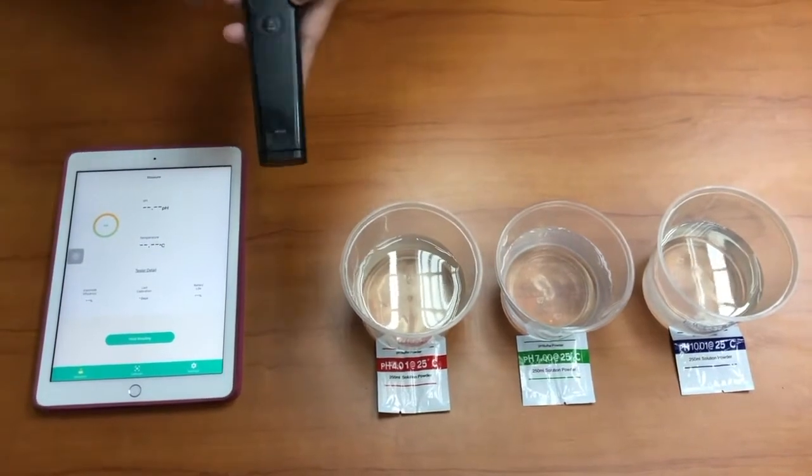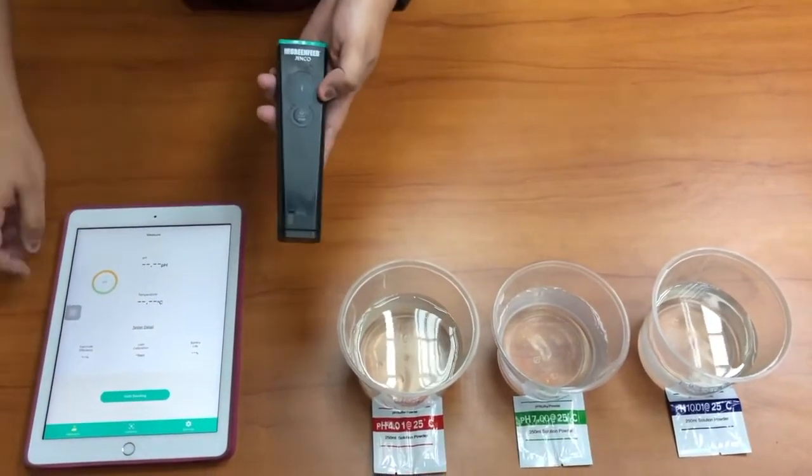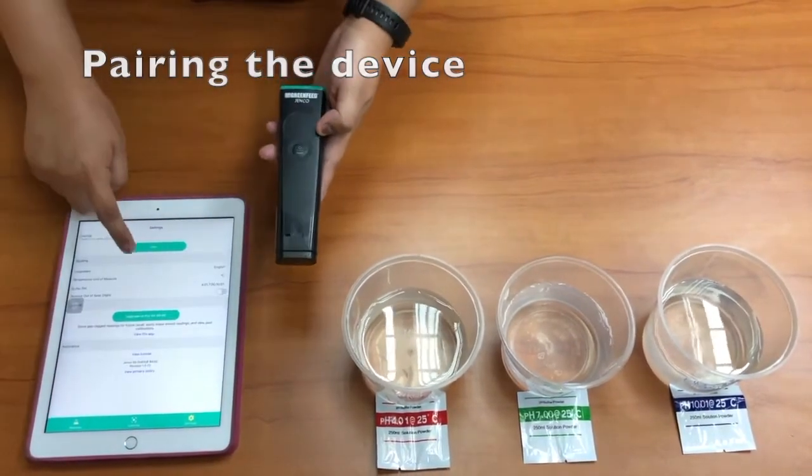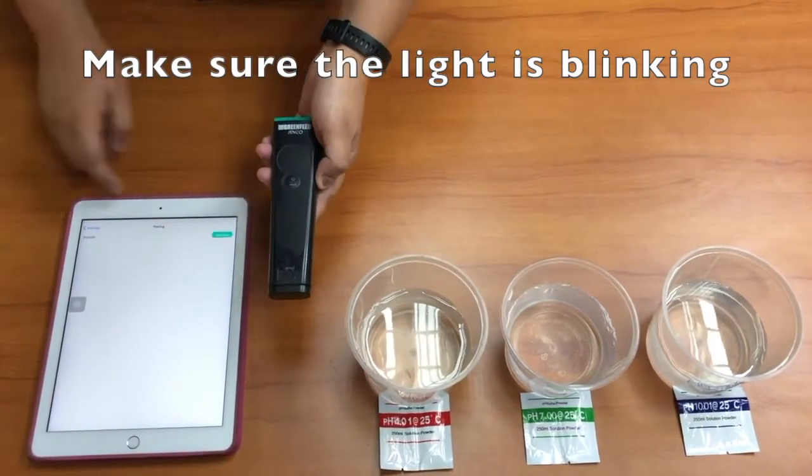Before we use it, we have to calibrate this pH meter, but before calibration, we have to pair this device to the app. We click setting and pair, turn on your device, and click connect. It's connected.